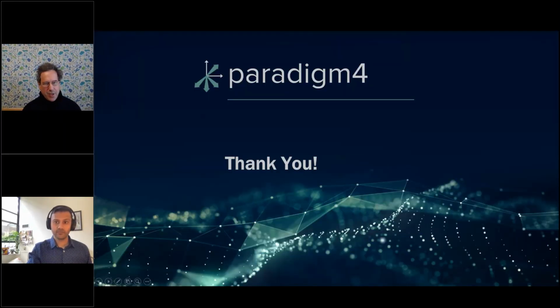I think we'd really love to get another collaboration going. We're happy to share all of the work that we've done and to make available, if it's of interest, SciDB into Allotrope to begin pushing this forward a little more.